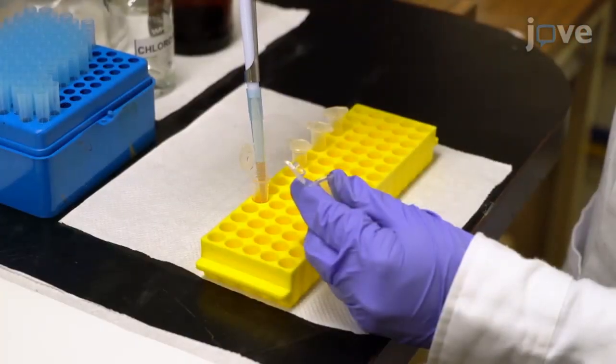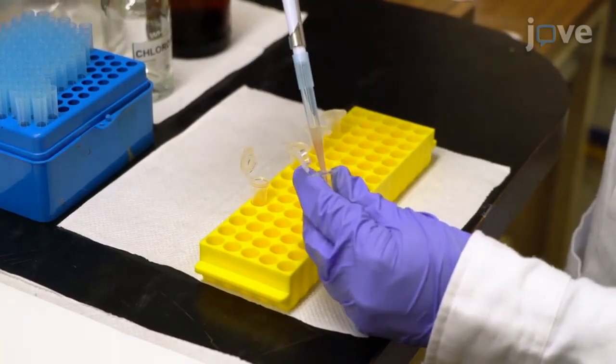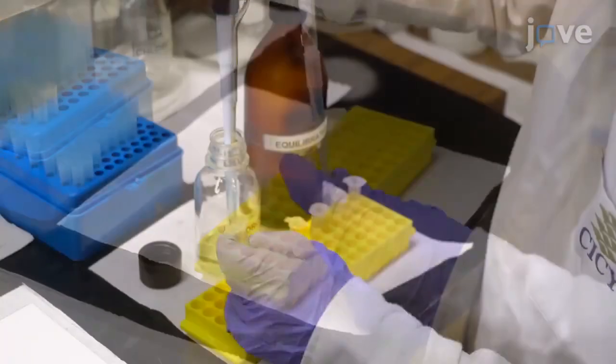Next, transfer 500 microliters of the sample to a sterile microcentrifuge tube. Then, add 300 microliters of chloroform-isoamyl alcohol.